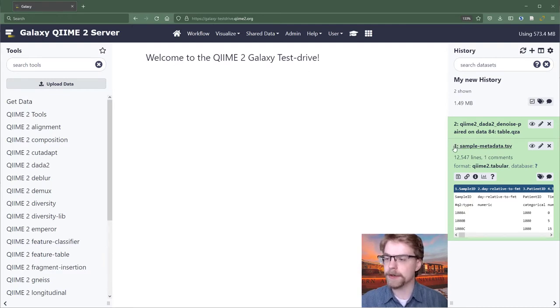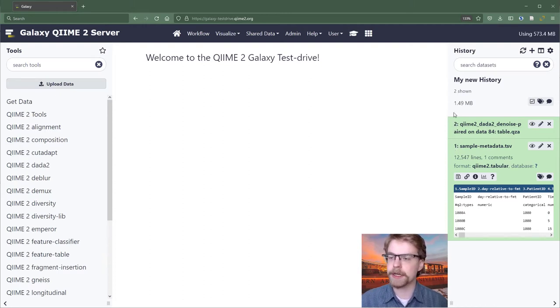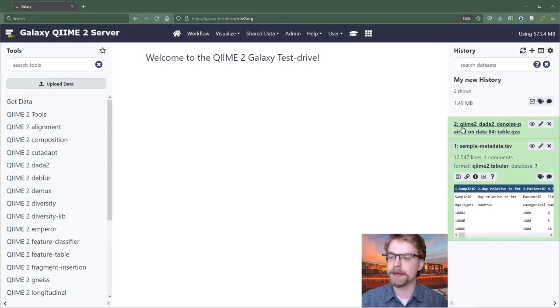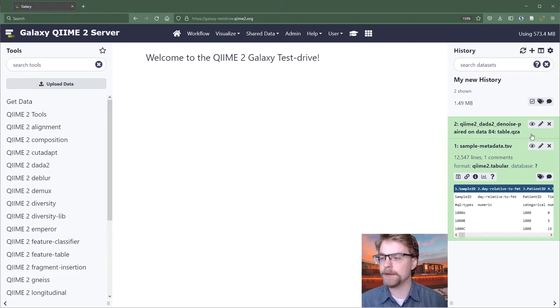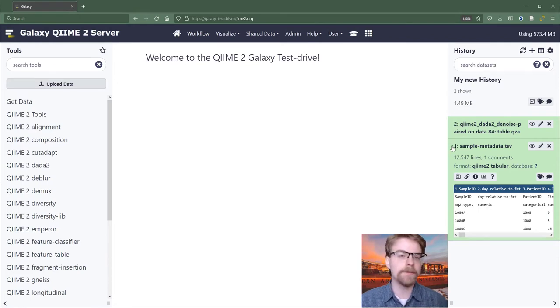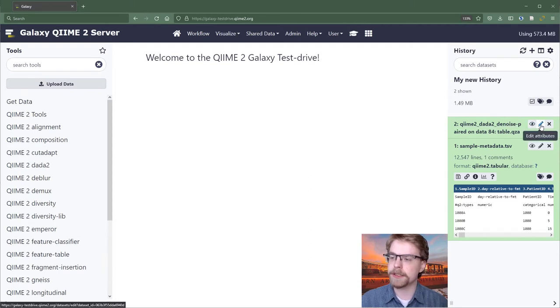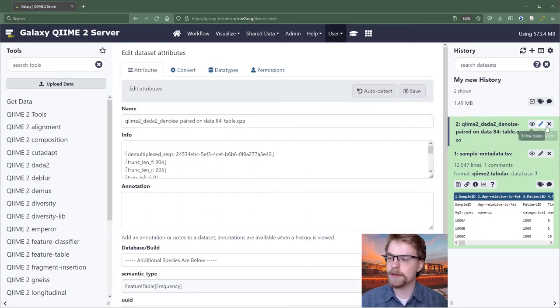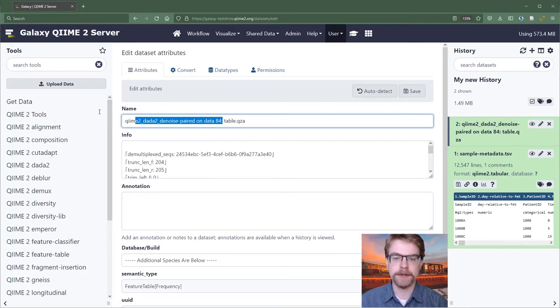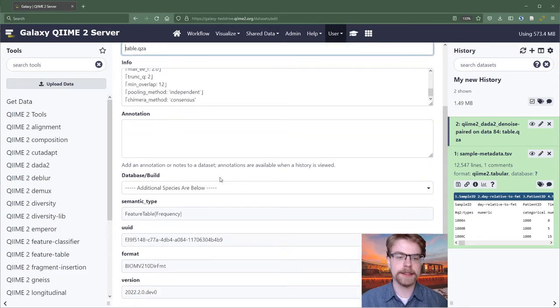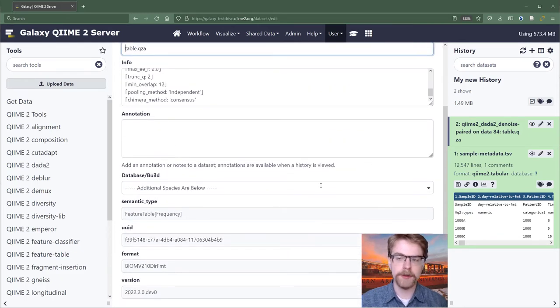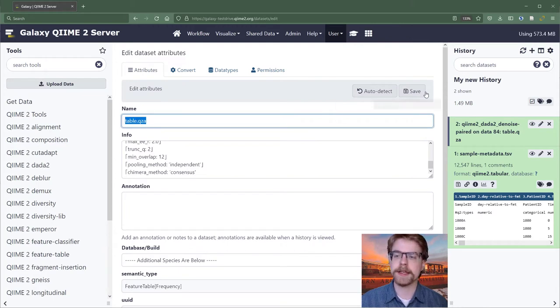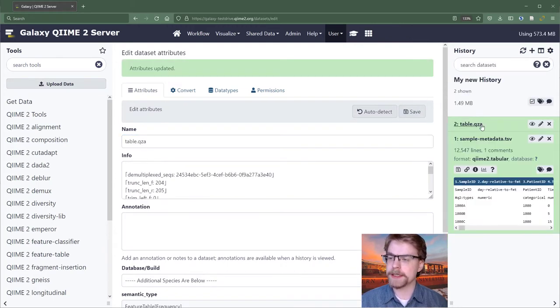They start with these numbers. So every element in your history is given an ID number which increments. Our first element is one, sample metadata. Second is QIIME 2 DADA2 denoise paired on data84 table QZA. Now that name doesn't necessarily make a lot of sense, data84. We don't have a data84 here. But that's because this came from its own history. So what we might want to do is actually just rename this. So we might edit the attributes using the edit button. We might just call it table QZA because maybe that's a sufficient name. Inside of here, we can add additional information. But mostly all we want to do normally is change the name. So now I'll save that. And so now we see we have table and sample metadata.